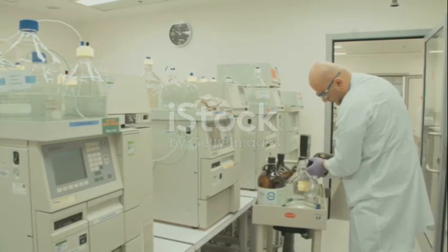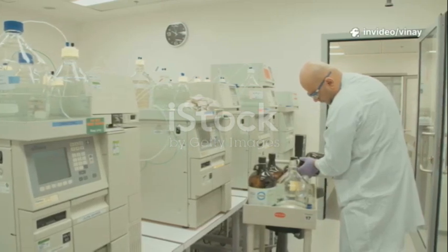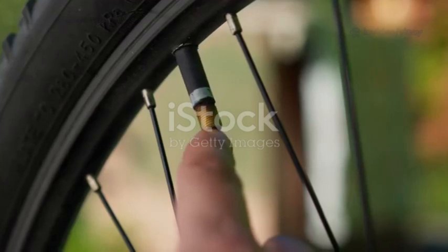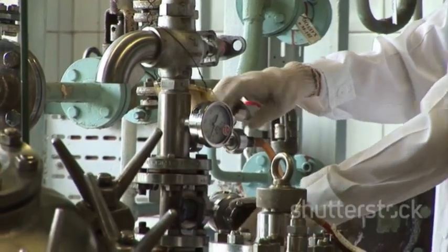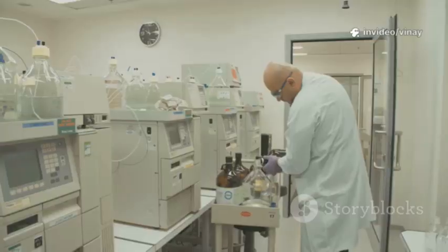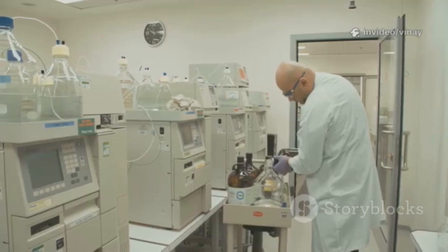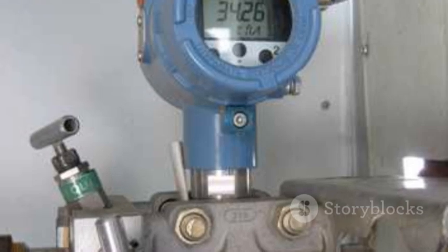The pressure hold test, also known as the pressure decay test, is another common and straightforward method for assessing filter integrity. It's kind of like checking a bicycle tire for a slow leak. The basic idea is to pressurize the system and see if it can hold that pressure over time. This test is often considered a simpler alternative to the forward flow test because it doesn't require a sensitive flow meter. Instead, it relies on a highly accurate pressure gauge.